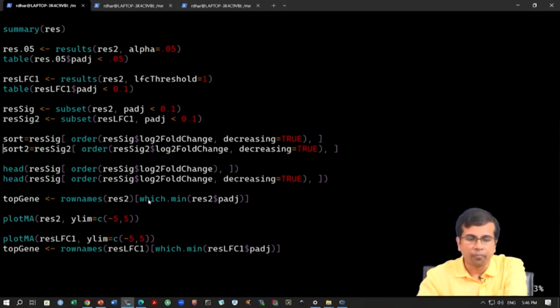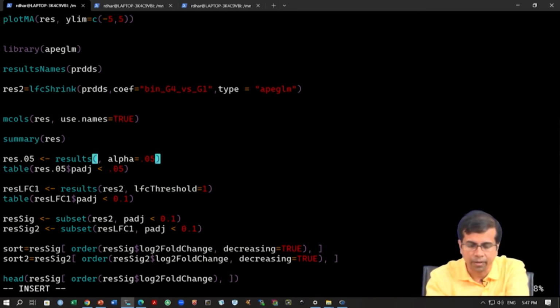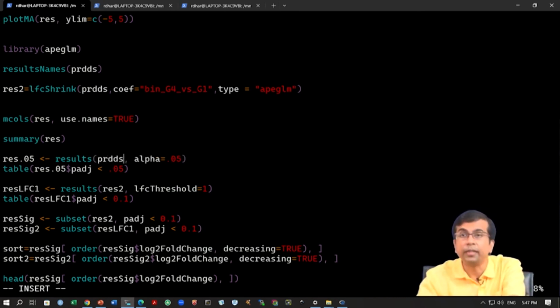Okay, all right. So what we can do is set our own filters, and we can run these different p adjust cutoffs. So we can change the FDR cutoffs, and we can also change the LFC threshold cutoffs. We'll try that using the results that we have generated, but we have to run this on the DESeq object.